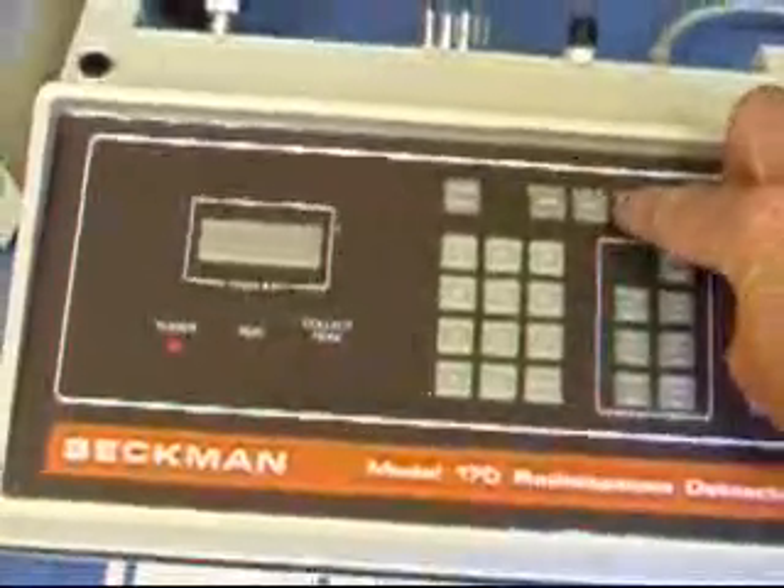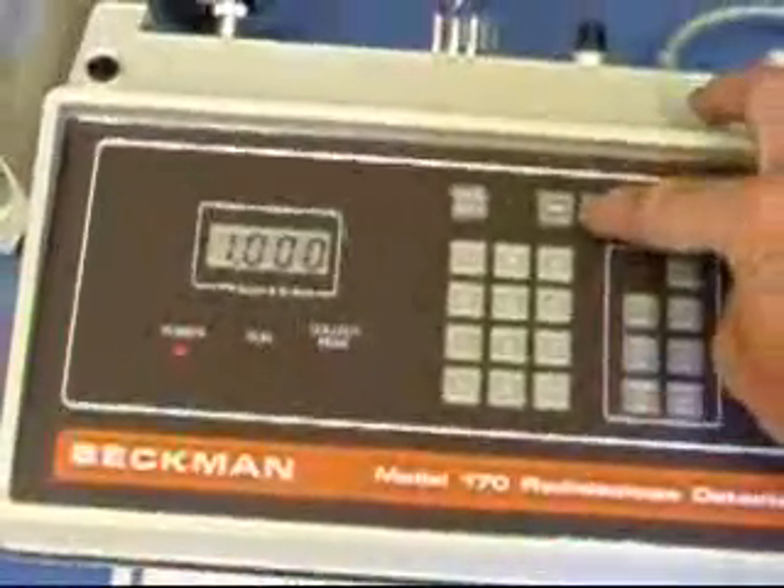The exponent button. It doesn't show anything unless you're holding something to enter.